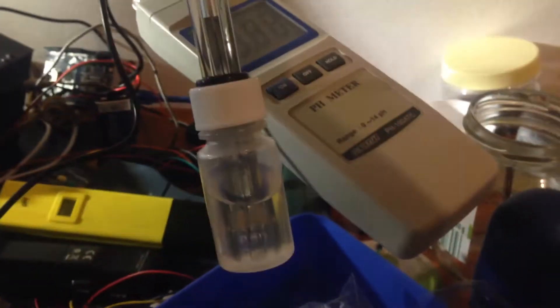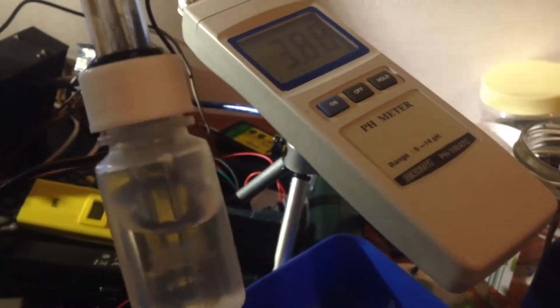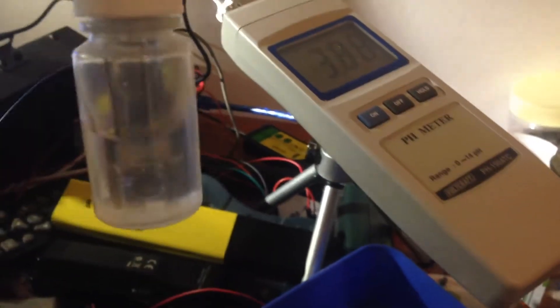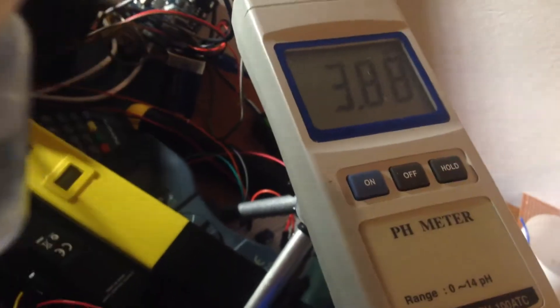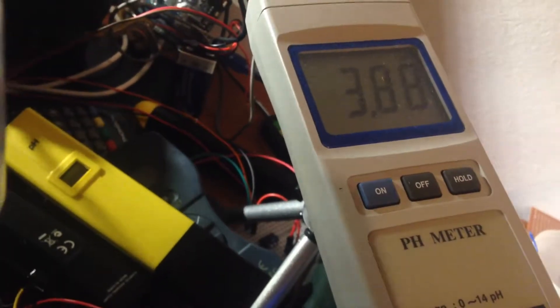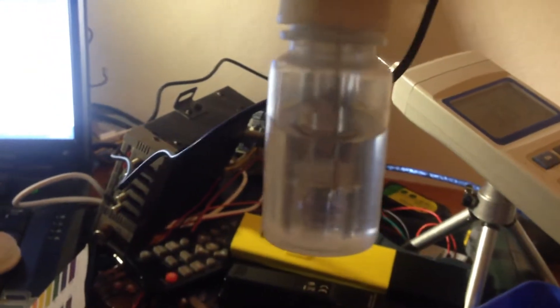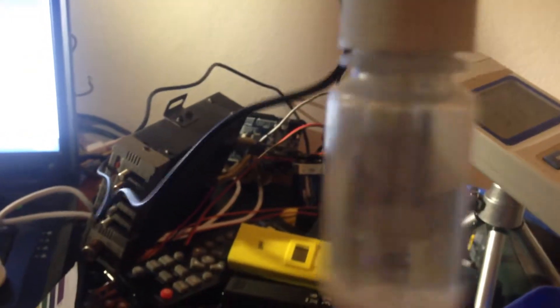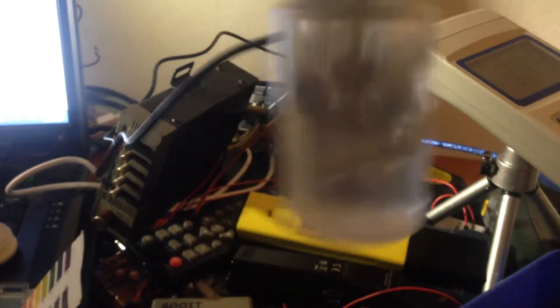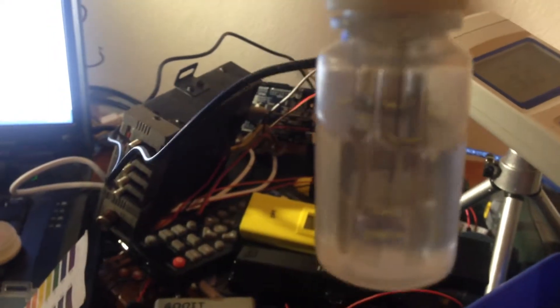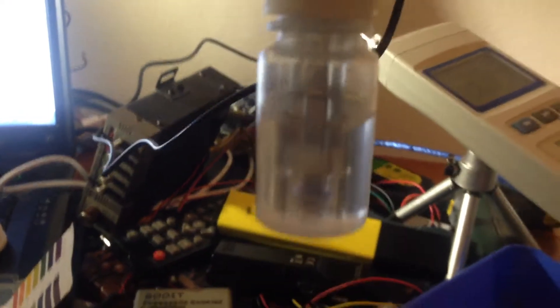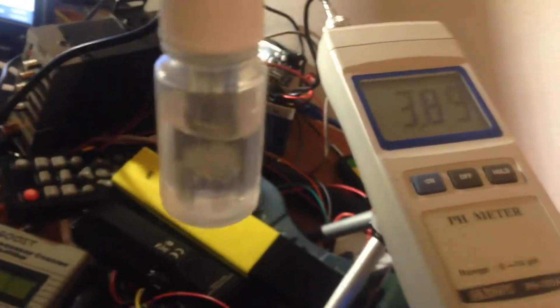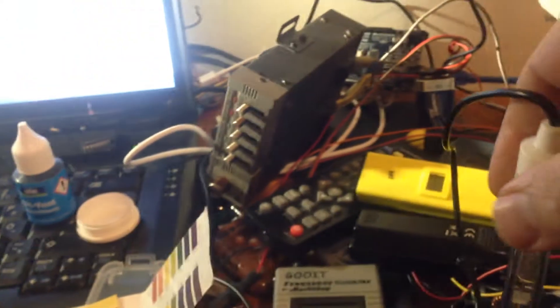This is the sensor of my pH meter. You can see the number of the pH at the start is 3.88. The reason is that this liquid the sensor is located in is auto-calibrating with this liquid and no need to calibrate this device anymore.